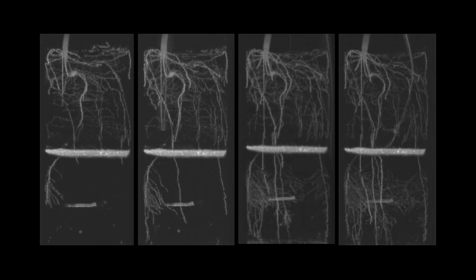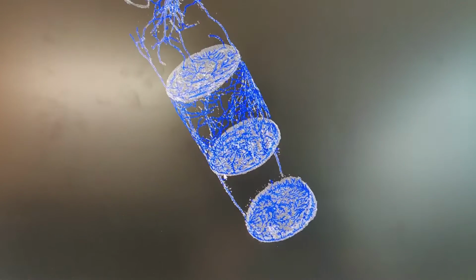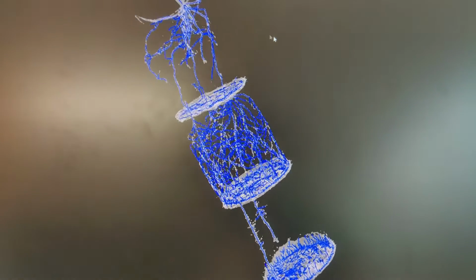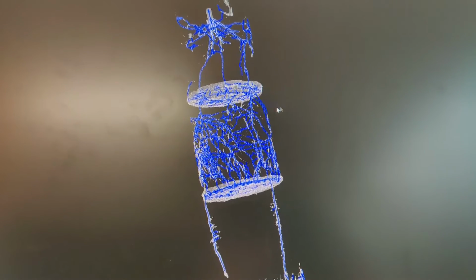This is an example of 4 2D images of the same root system taken in 4 consecutive MRI measurements. An increase in the growth of the laterals in layer 2 is clearly noticeable. The software NMRooting can be used to generate 3D images of the root system architectures as well. These images can be analyzed for several parameters such as root length, diameter, and biomass.